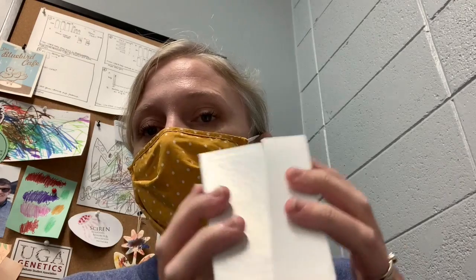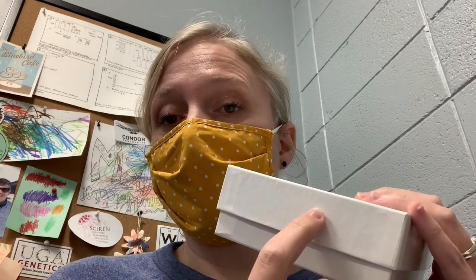And often in the molecular biology parts of the lab, you're going to have lots of tubes, just tubes on tubes on tubes. And we have some of these freezer boxes that look like this, that have racks. And one of the things you can do to keep organized is to make sure your boxes are labeled with your name. And then as you're in the lab longer, you might have your name, PCR products, your name, riboprobes, and so on, so that you can keep track of all of the different types of reagents you're generating.